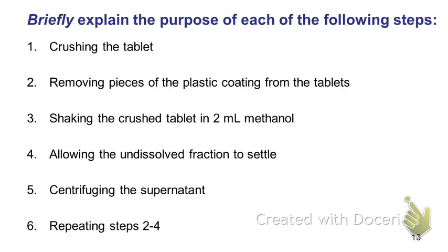So that is pretty much the whole lab, which brings us to the group activity. A couple things that I want to address before giving you free rein on this. The intent of this group activity is to get you thinking about the procedure. Whenever we've got quizzes, everybody asks, what questions would you ask? Well, what we end up doing to figure out questions is we look at each individual procedure and we say, crushing the tablet. Why did we make them crush the tablet? There's a perfect question. Why did we crush the tablet? Well, what was the answer you guys gave me? Increase the surface area so we can maximize our interactions. That's how we generate our questions.